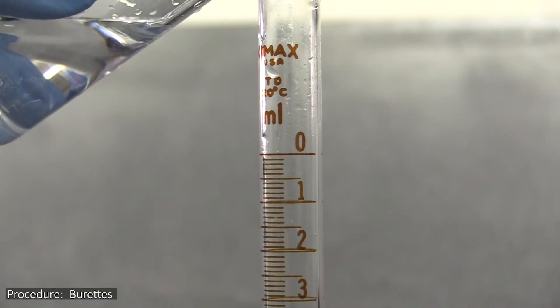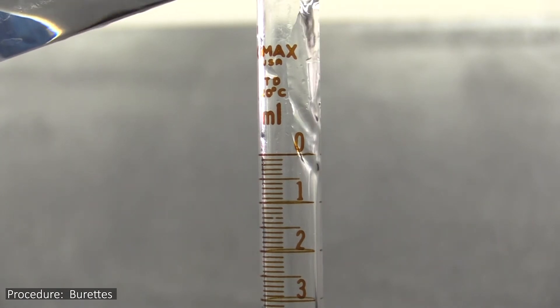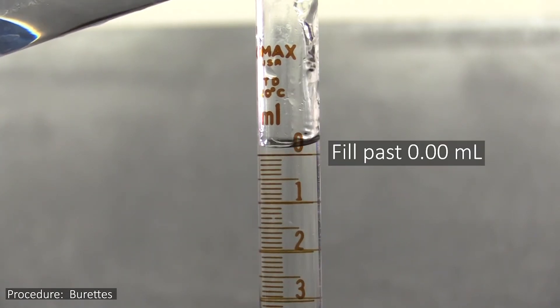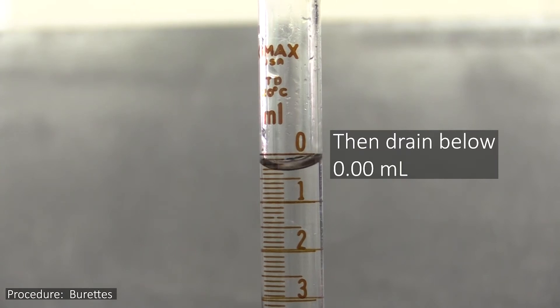To set one of these up, you first rinse it with the solution you were going to dispense out of it, in this case sodium hydroxide. You then fill it past the 0.00 mL mark and drain a little bit of the fluid out, enough to get the fluid below the 0.00 mL mark.